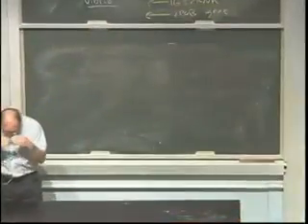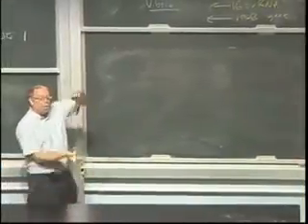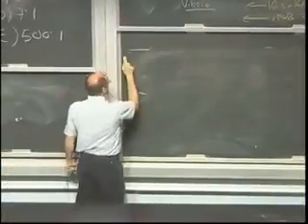So at low power magnification, let's say the 4x objective, we're looking down on the microscope. So when we look down on the microscope, we're looking in this direction. So I'm going to draw that here. We have what's called a depth of focus. So this much might be in focus in the vertical direction.